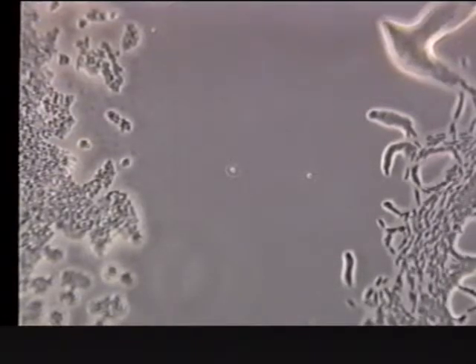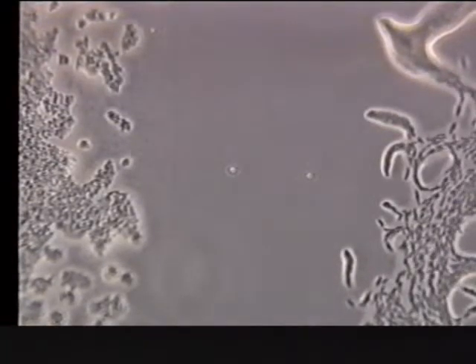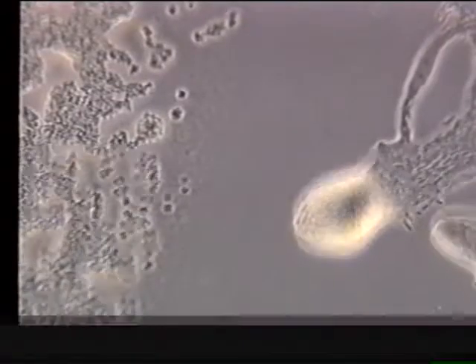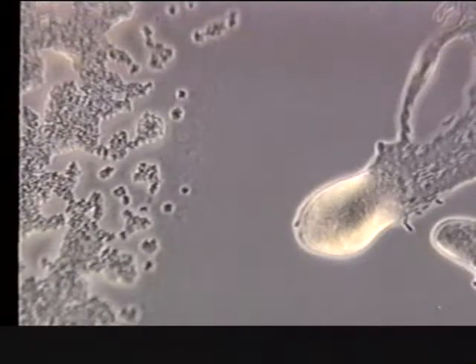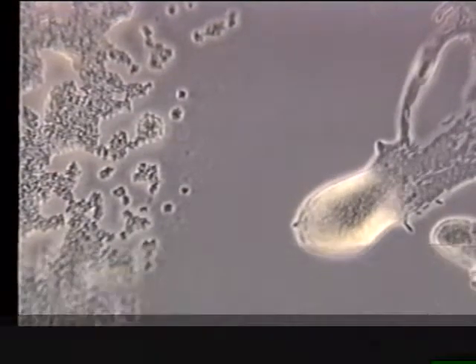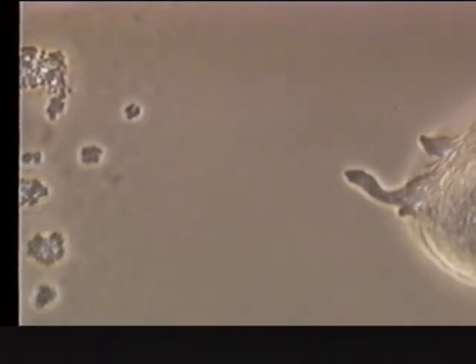Now we see the myxobacteria approaching the Micrococcus luteus. Micrococcus luteus is on the left. These are spherical bacteria. And the swarm of myxobacteria is approaching. And you will see them approach the Micrococcus and lyse the cells. See the tip of the swarm at the right is moving towards it.